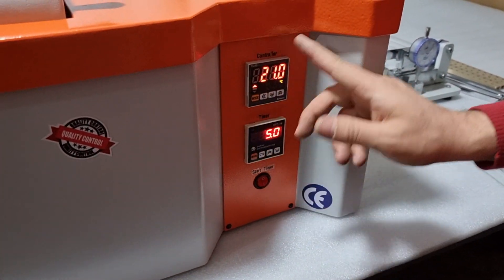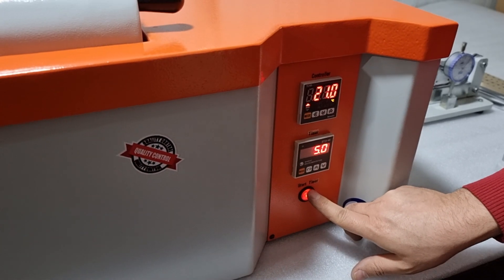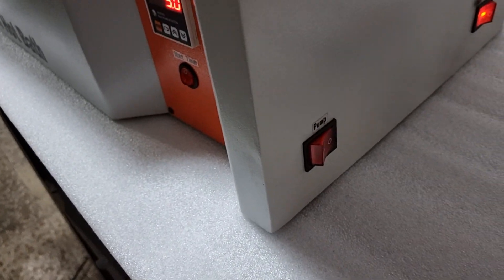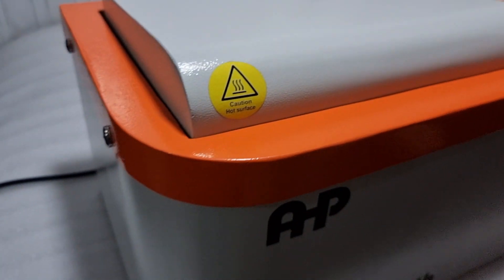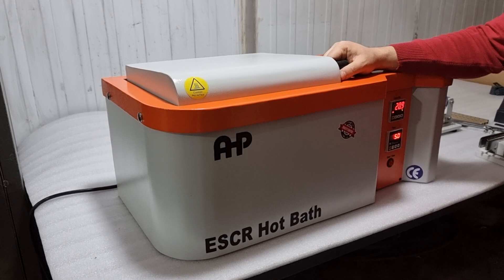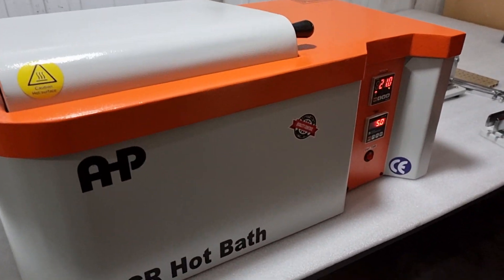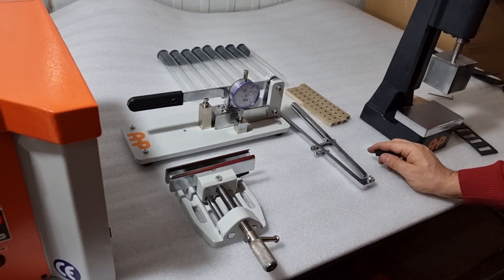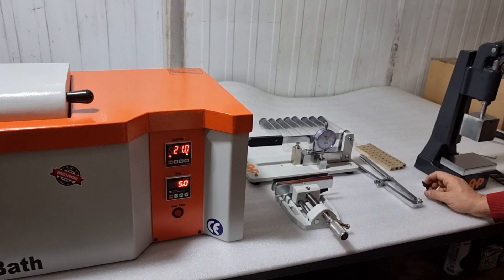Place all 10 sample tubes into the bath and adjust the temperature to 50 or 100 degrees centigrade. Set the timer and start it after setting the correct time as per standard. There is also a key here for the circulation pump. For this small hot bath, the circulation pump does not need to always be on — it is for circulating the liquid inside the bath to maintain a homogeneous temperature at different positions. This is the standard delivery of the equipment for the ESCR test according to ASTM D1693 from HP Plastic Makina.